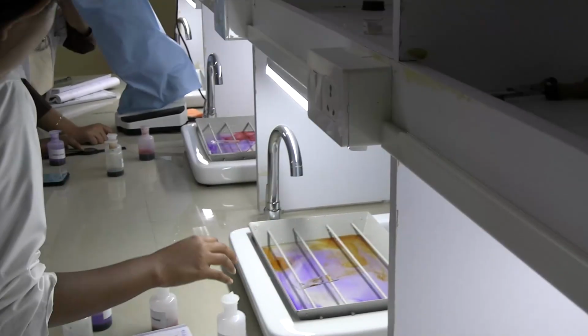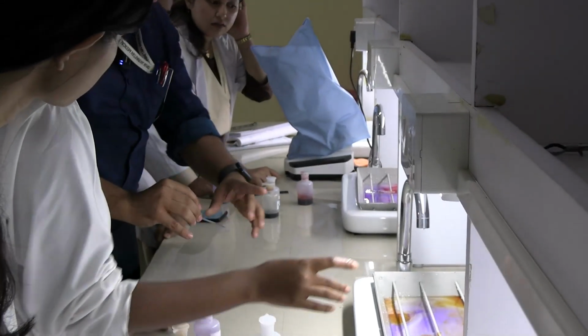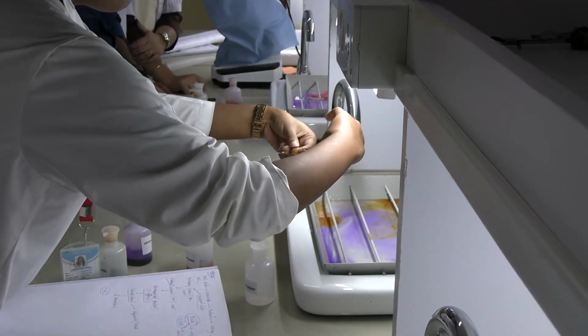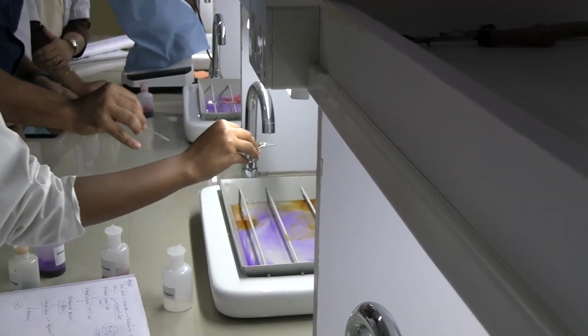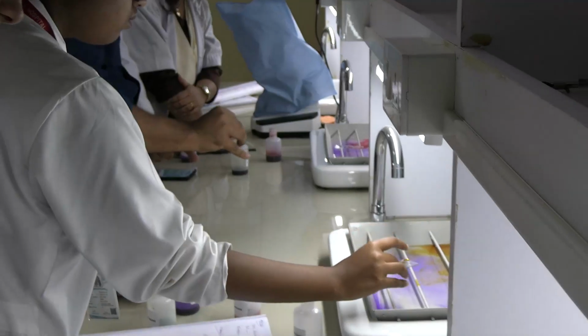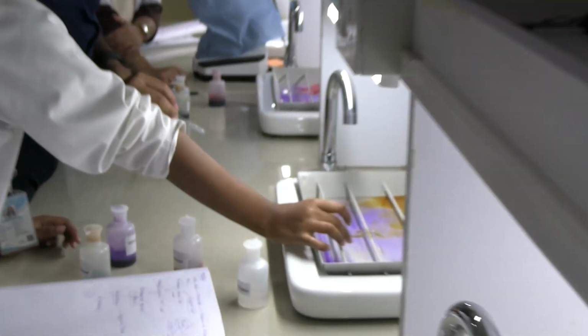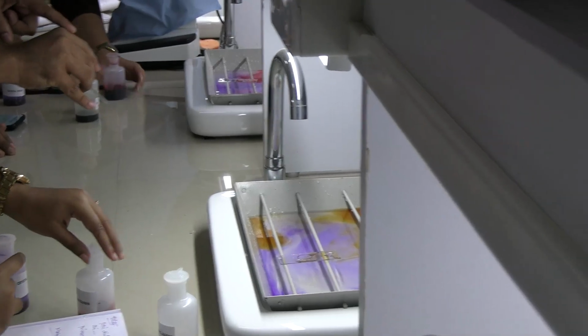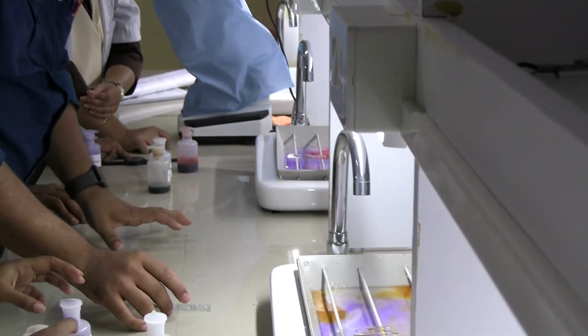You have to hold the slide at the end so that your finger rests above the smear. It's like this. Above the smear. You guys get this one? Yes, sir. And then you're gonna pour the water on the top of your fingers. Okay. Now we'll do the acetone.